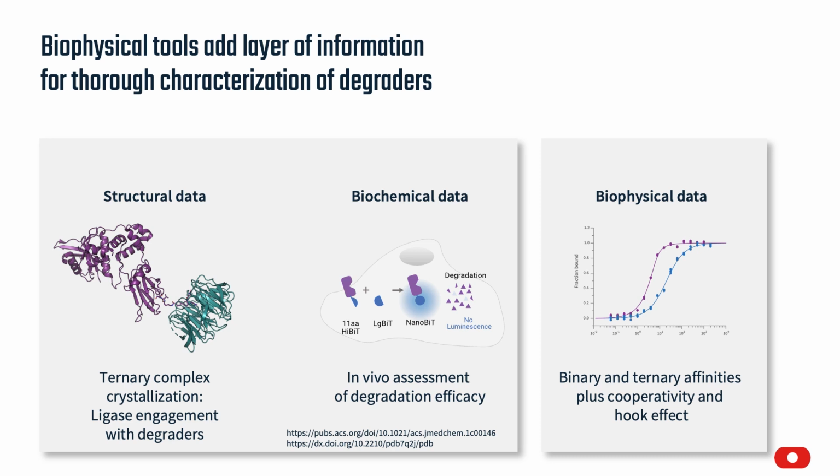molecular interactions. In this study, our Dianthus platform was used for biophysical characterization of a set of WDR5 degraders to complement the structural and biochemical characterization previously done by our collaborators from the Structural Genomics Consortium, or the SGC, at the Goethe University in Frankfurt.